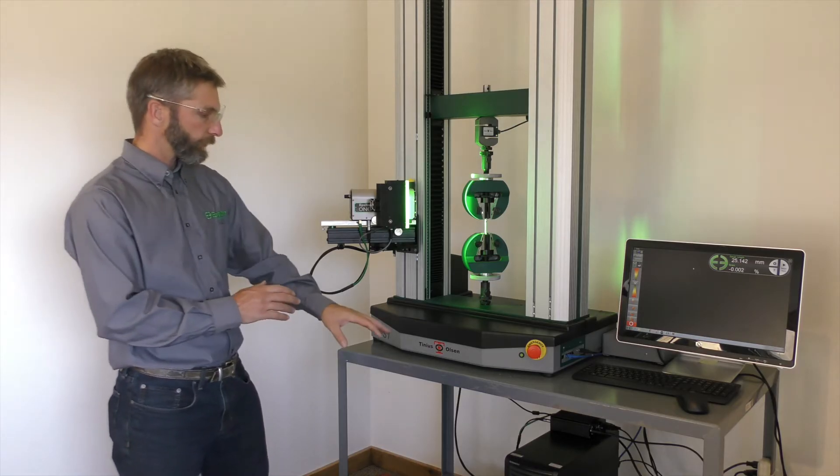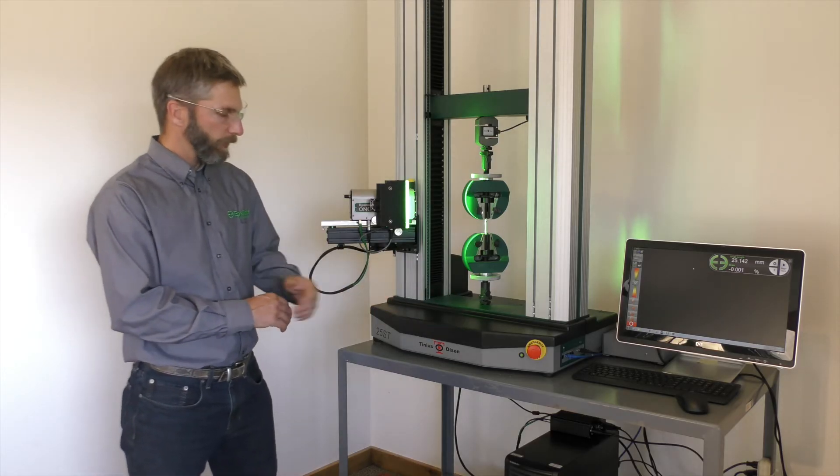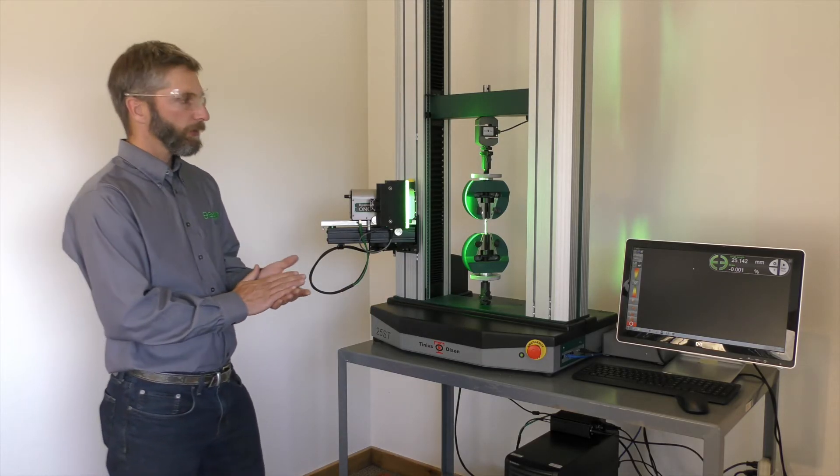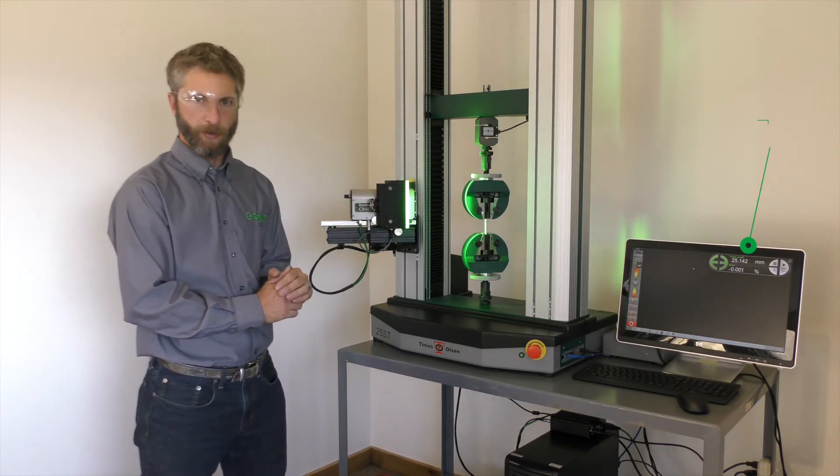Additionally, the sensor controller is connected both to the test frame through analog, and to our PC via a digital communication interface, which we're using for our GUI.